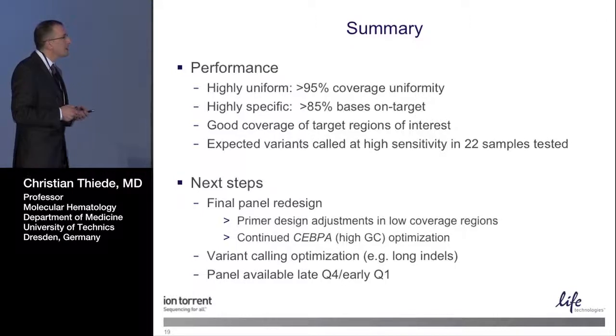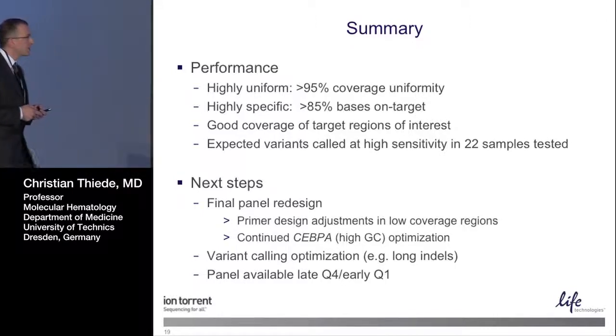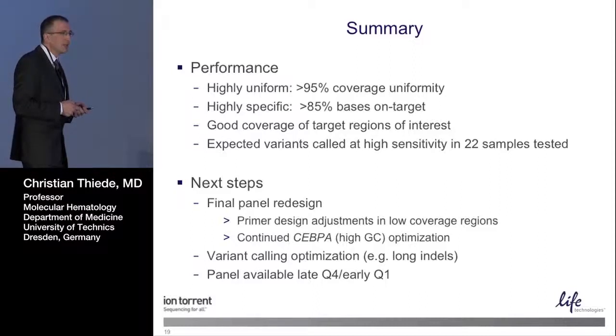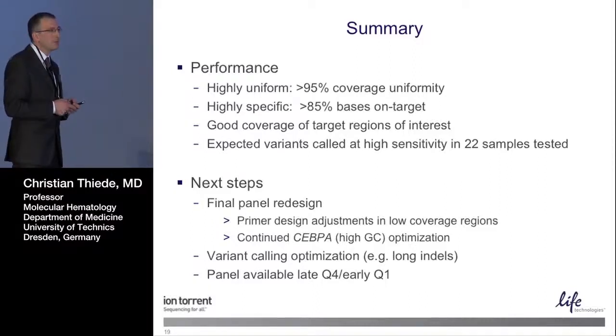And also the long indels can probably be managed. So we expect to have an alpha or beta version of the panel ready late Q4, probably early Q1, and this will then be distributed to interested groups later on.